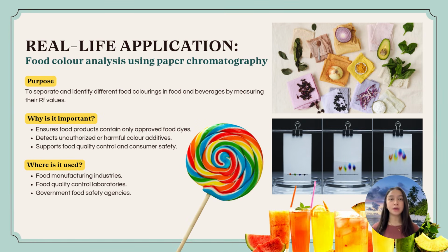Next, I will talk about the real-life application of chromatography. Our group will be presenting about food color analysis using paper chromatography. The purpose of chromatography in food color analysis is to separate and identify different food colorings in food and beverages by measuring their Rf values.